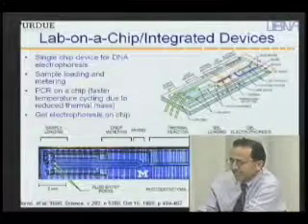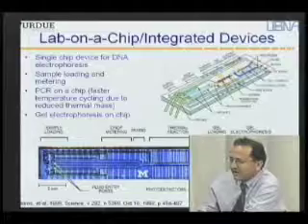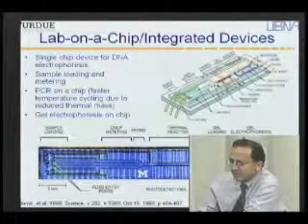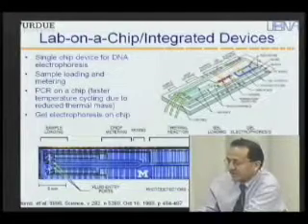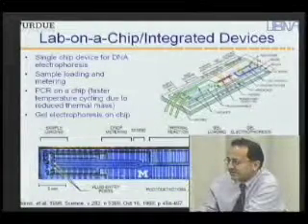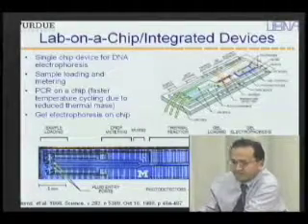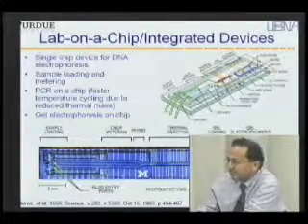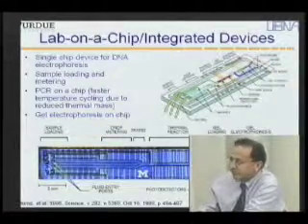In this case, they connected air lines to move the sample using pressure-driven flow, in terms of the loading and the metering. And then they perform some mixing in this region right here, and then there is a thermal reaction region where you could do PCR.